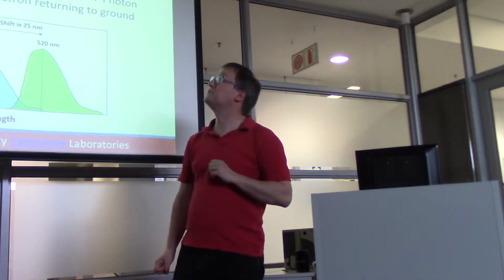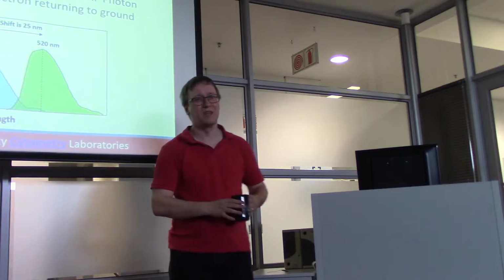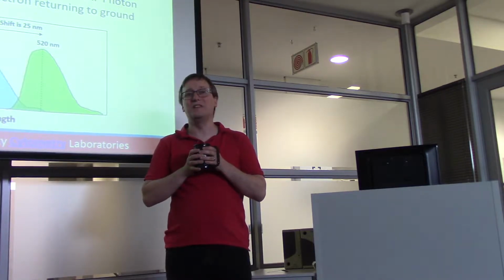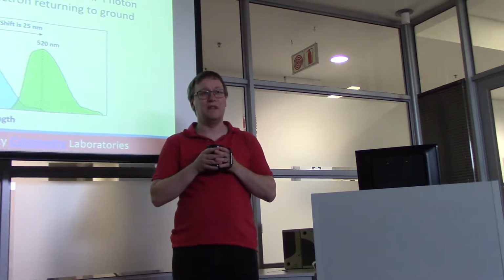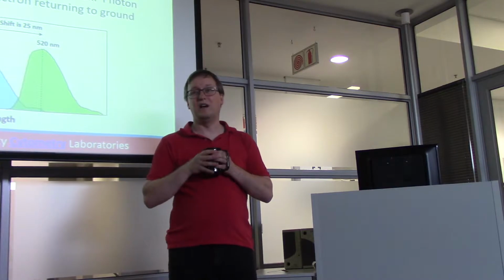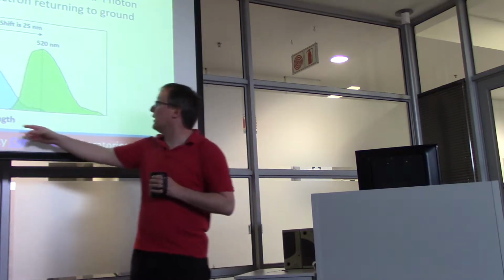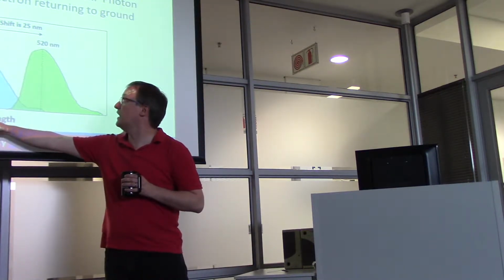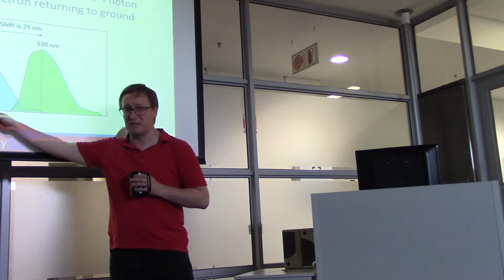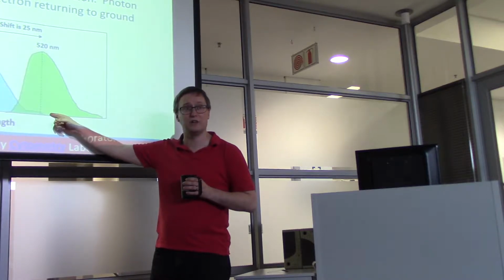Does everyone remember the term Stokes Shift from undergraduate chemistry? Oh, good. Well, we'll have a moment to remember this. All right, so we know that mass and energy are neither created nor destroyed. In this case, we are accepting some light at the fluorophore, and we're releasing some light. We do have some amount of inefficiency in this transfer. As a result, if you have an input wavelength of 495 for a fluorescein molecule, we see that the light it emits is not at the same frequency as what it's accepting. Instead, we see a shift to a longer wavelength. Is that a shift to higher energy or lower energy?